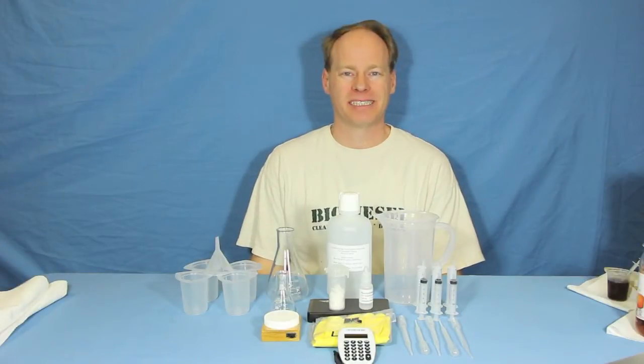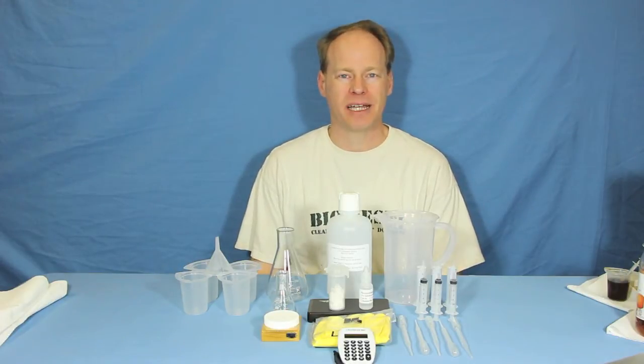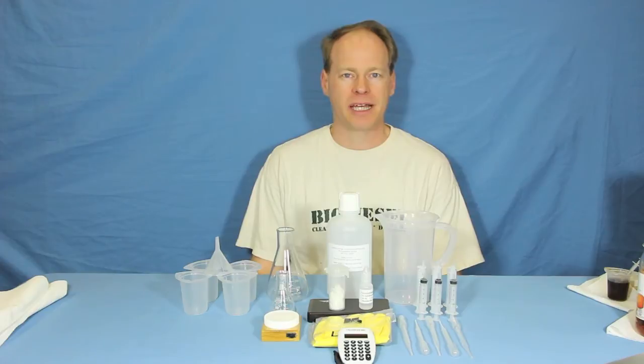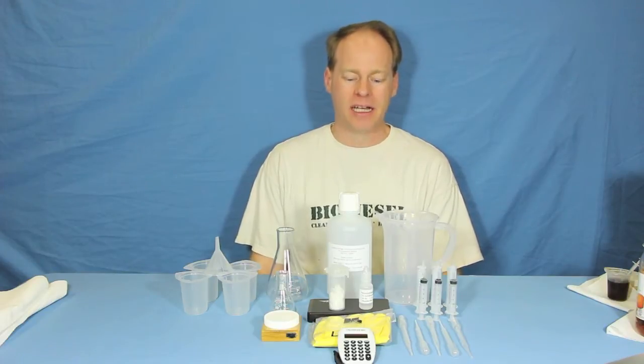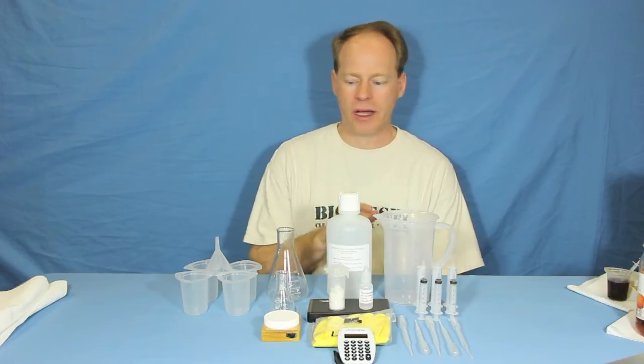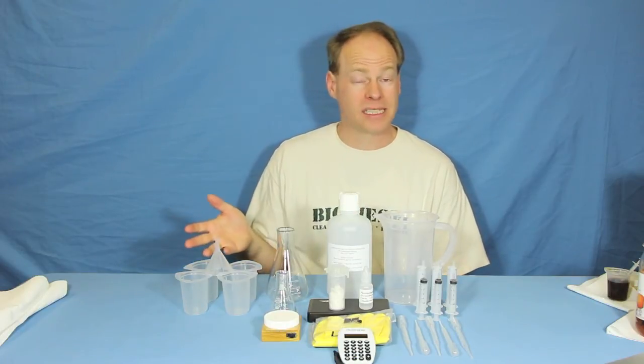Hi, my name is Graydon Blair from Utah Biodiesel Supply, and today we're showing off our deluxe biodiesel titration kit. This kit has everything that you'll need to titrate oil to make biodiesel. All you've got to add is some isopropyl alcohol, some distilled water, and some oil to titrate, and away you go.